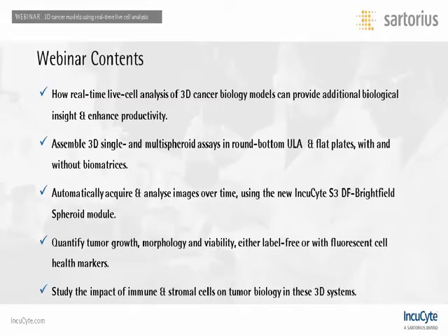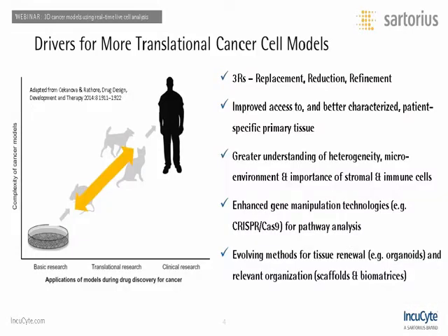I will briefly describe validated protocols for creating two types of 3D multicellular tumor spheroid models, and how biological parameters such as growth and viability can be returned through the capture and analysis of bright field images using integrated software designed specifically for 3D cultures. Finally, I will demonstrate how the development of more complex co-culture models can be investigated using the IncuCyte S3.